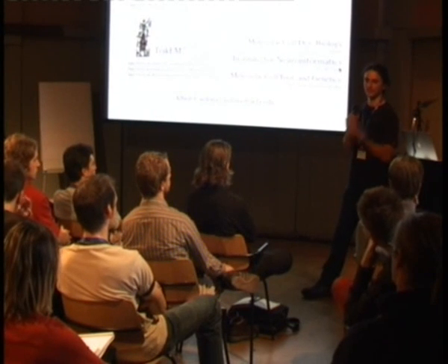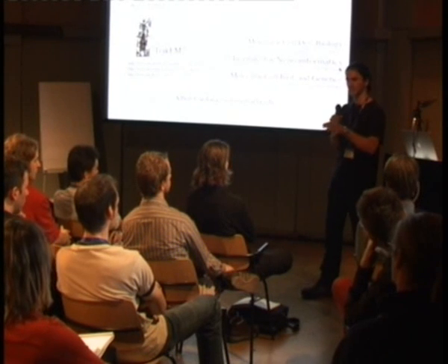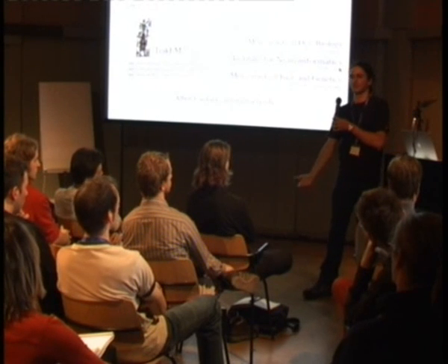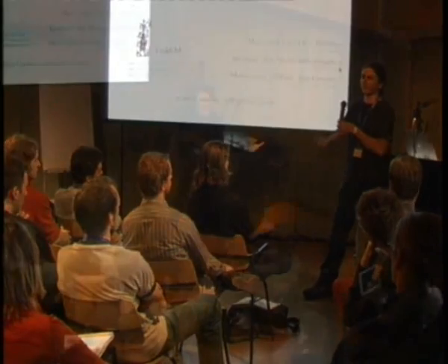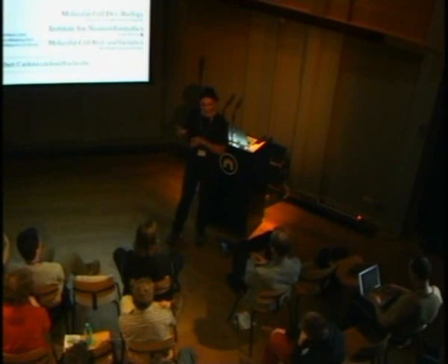You have to say that your eye is saying so, or you're saying a parameter. And if this fuzzy edge changes through your sample, because as you go deeper in a sample, for instance, the image quality is worse. So then your object is very nice and clean at the top, and at the bottom it just looks like crap. So the same algorithm will fail. I mean, it will be fine at the top and will fail at the bottom.